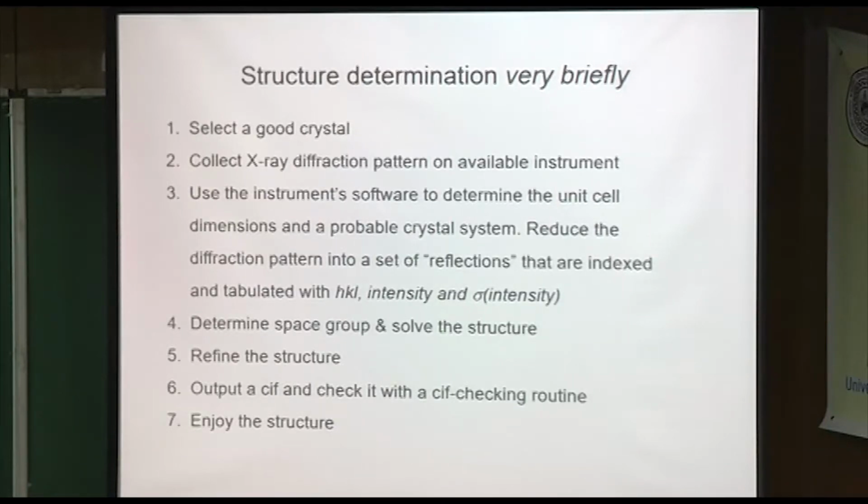Solve it, and there's such fast solution programs now, it's unbelievable. Refine, now that could take a little longer. Usually you can get a crude result fast, but to get the final refinement, including nasty solvent and things like that, may take a day or two.